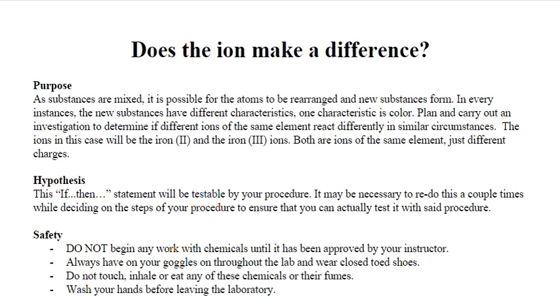All right, this is your pre-lab video for your first chemical reaction lab. This is going to look at how different ions potentially can form new substances. So the purpose of this lab is you're going to have a mixture of substances, and based on those substances being mixed, you should see a color change. Color change is one of the indicators that a new product has been formed, so a chemical reaction has occurred.